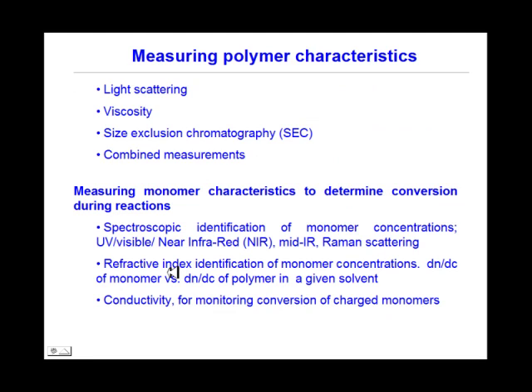Now, how do we measure these polymer characteristics? By light scattering, viscosity, within size exclusion chromatography, and by combined measurements.